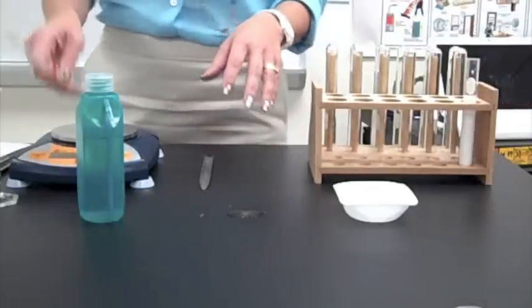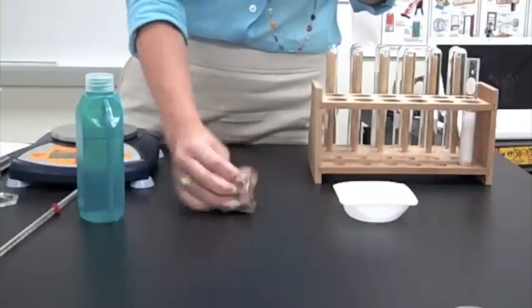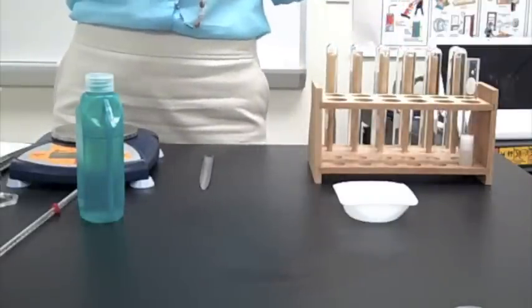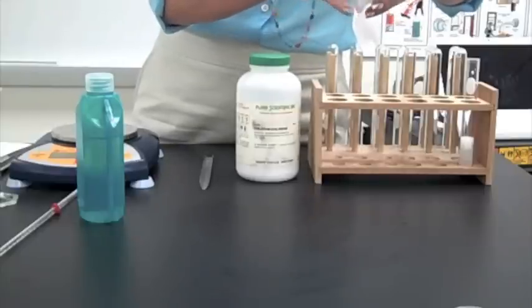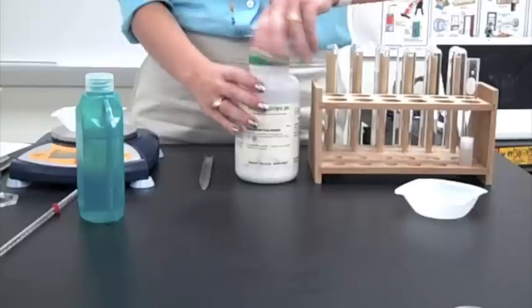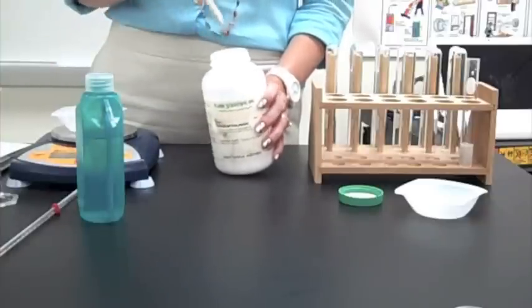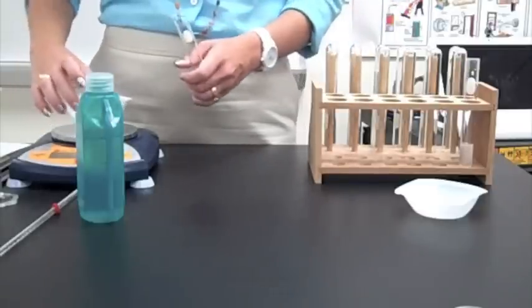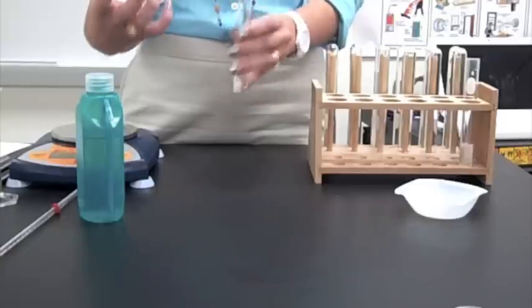Now, the second reaction we're going to do involves calcium chloride. Calcium chloride says we need 1 gram in another weigh boat. Zero it out again. And we need to measure out 1 gram calcium chloride. 1.02 works for us. And using the same solid transfer technique, pinch either side, put it in the test tube. And there you go.